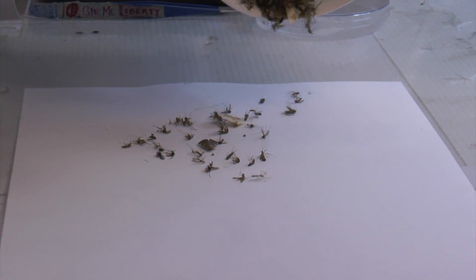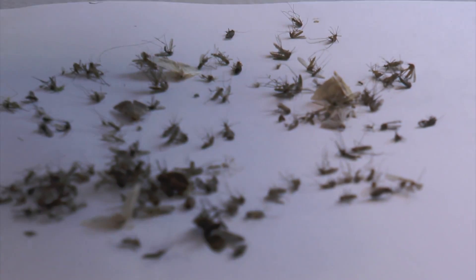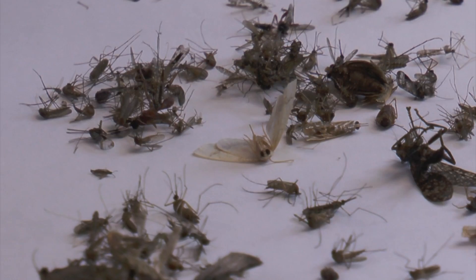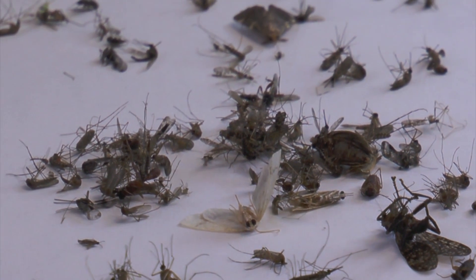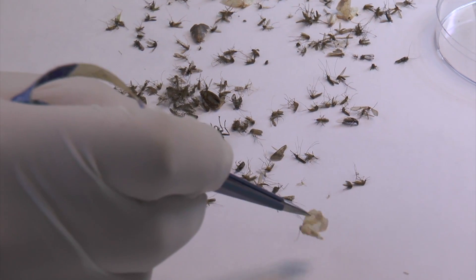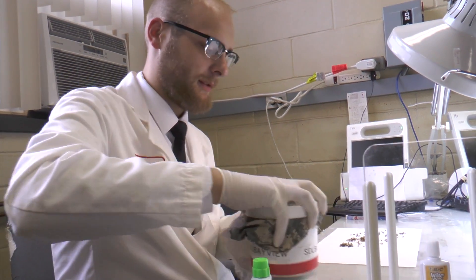So this is bycatch. You also get moths because these traps have a light, so all types of other insects are attracted to them as well. Little beetles. You also get little nymphs or things that look like mosquitoes, so you have to learn to pick them out. It's easier just to get rid of the bycatch as early as possible so it doesn't clutter your view.